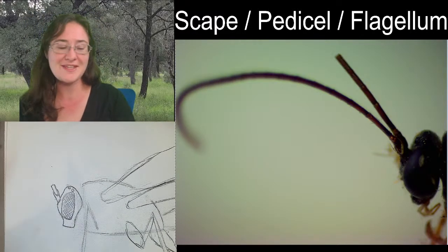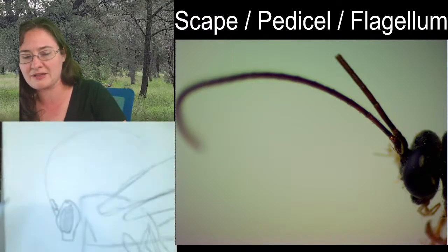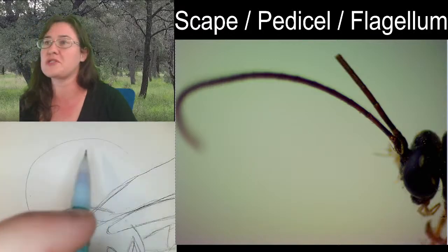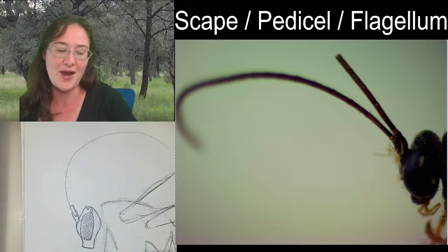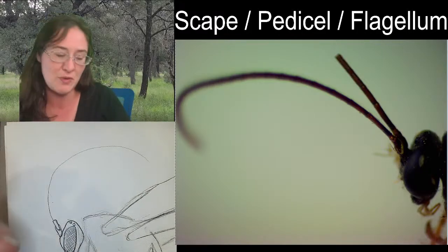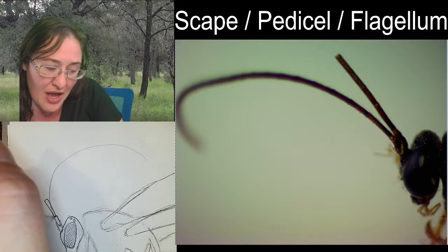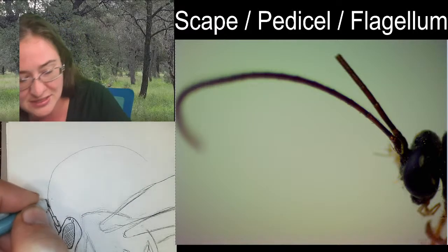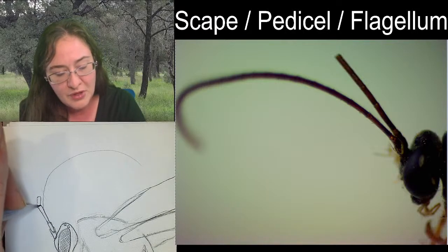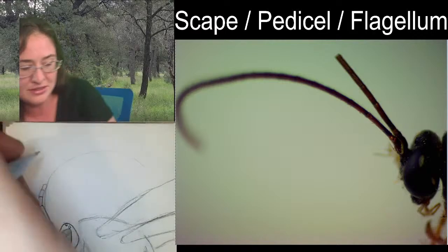So with this guy, I'm just going to take his antenna and pull it back like this, and it's just going to go up and over its body rather than going forward, where I don't have any room on the paper. And because it's not going to be interacting with the legs, I'm just going to sketch them now. So getting that first segment of the flagellum that's nice and long, and then just getting the remainder ones.